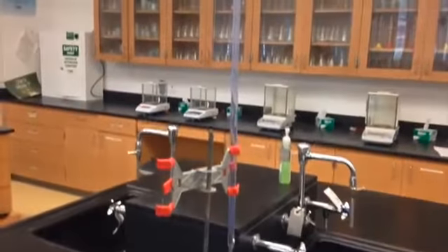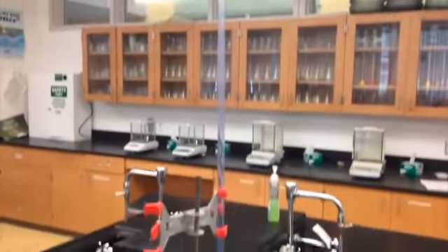This is the proper setup for titration. Place the burette in the burette clamp and then position the Erlenmeyer flask underneath it.